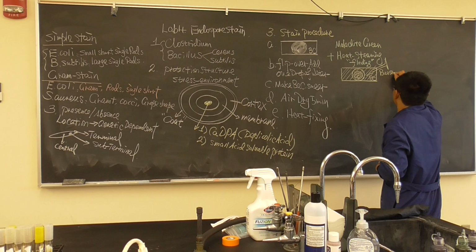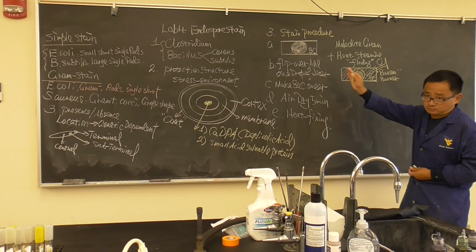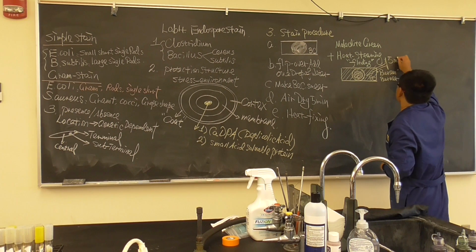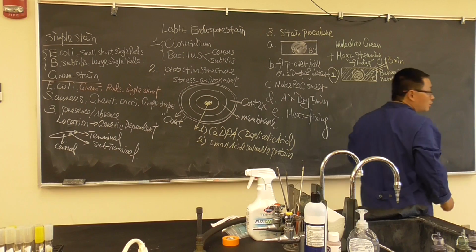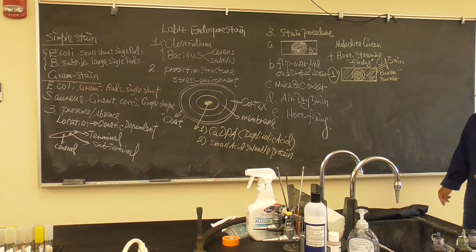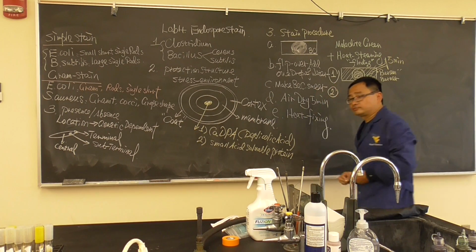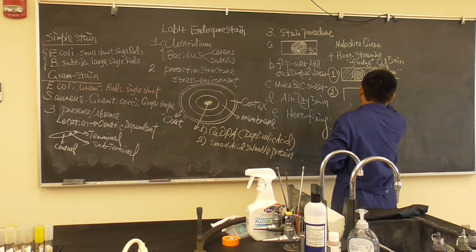A Bunsen burner to do back and forth steaming for 5 minutes. This is one of the methods. We will have 2 groups. One is working with me, I'll do it. Then another group is working over here. How we do it is a little bit easier.